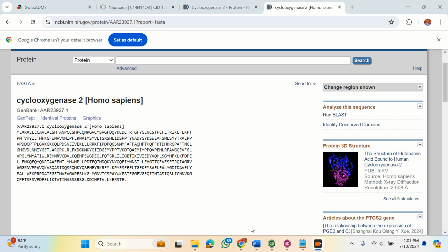Yeah, Swiss model. If you just type Swiss model and hit enter, it's supposed to show up this way. As usual, you click the first option here. Then this will show. You make sure your internet access is good.